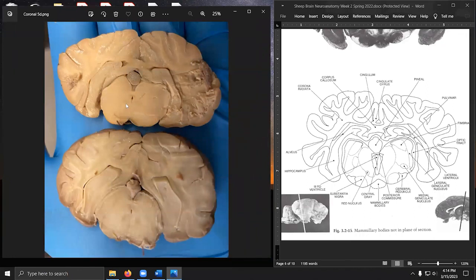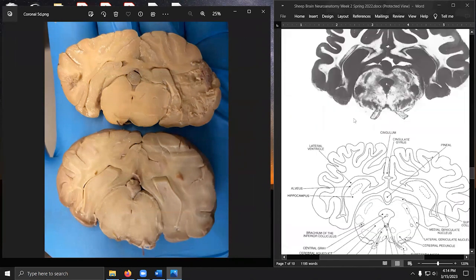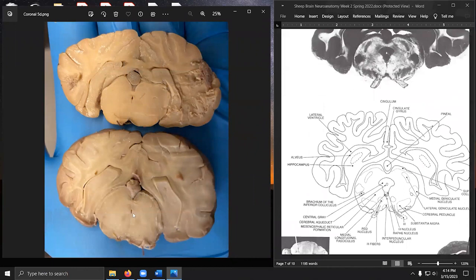So we're not going to bother with the top part quite as much in this case. We've kind of already established that as this previous page. We're going to go ahead and skip down to the next diagram because that better matches this section down here. We now have the back of the backbone of the hippocampus. So let's go ahead and draw that a bit. We can see it sticking out here. Same thing on the other side.